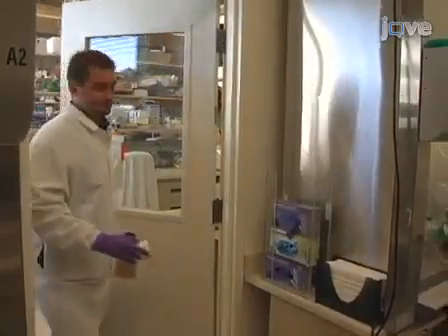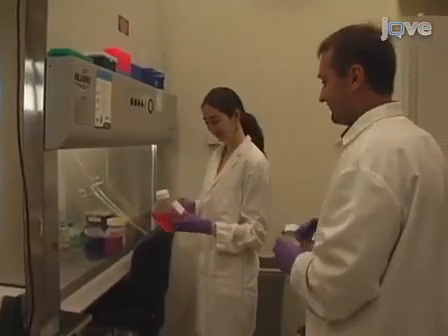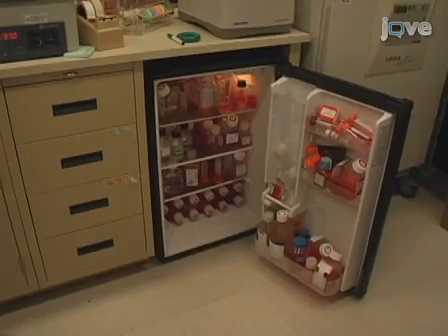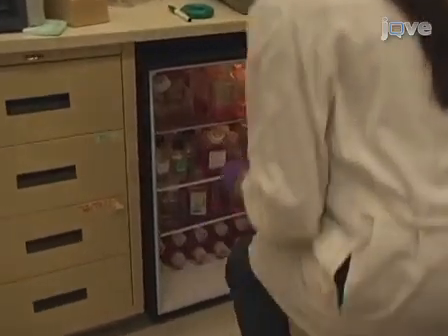Where possible, the steps of the following procedure should be performed in a tissue culture hood. Prior to dissection, prepare ACSF media for brain dissection and slice preparation, as well as slice culture media according to the written protocol, and store them at 4 degrees Celsius.